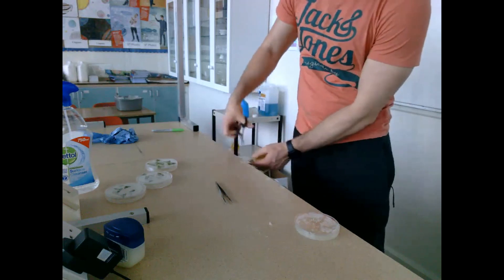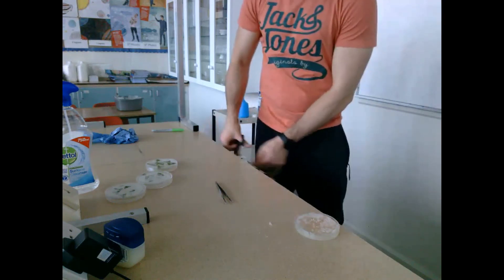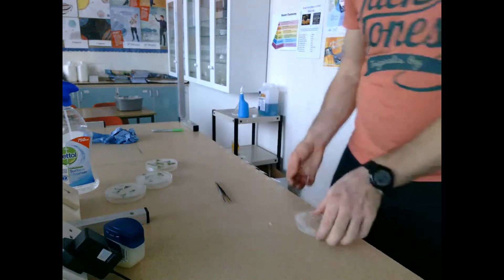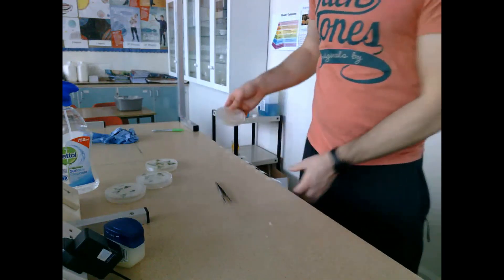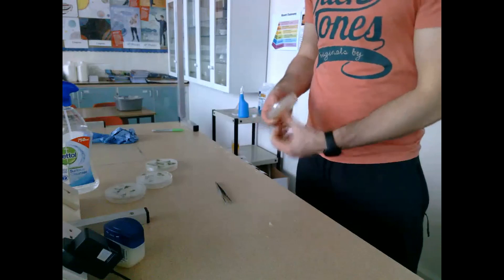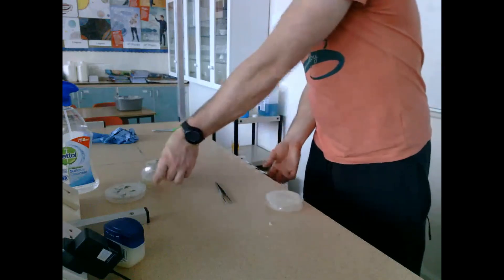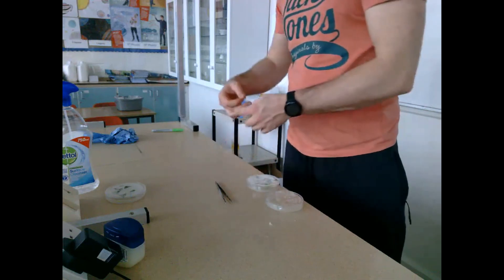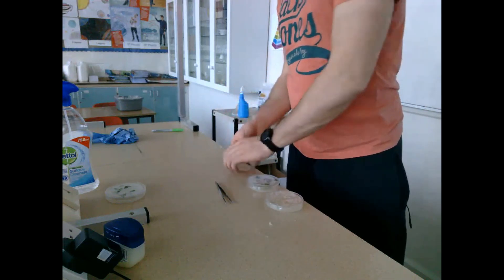I put two pieces of sellotape on each plate, then leave them standing for 24 hours. After that, they get flipped and incubated for three to five days at about 25 degrees. This gives time for any colonies that might be present to develop to the point that we can actually see them, because yeast is very, very small.